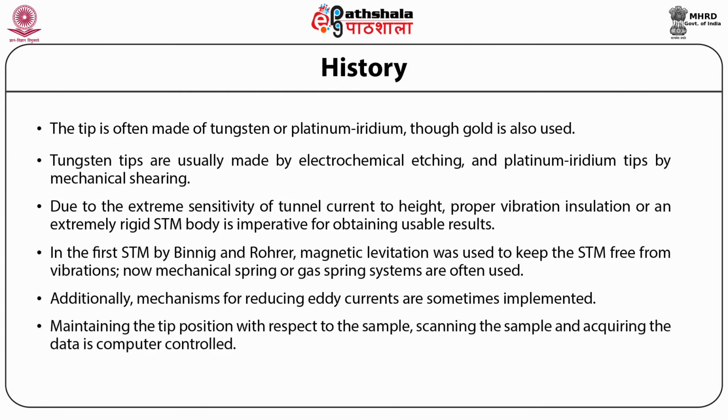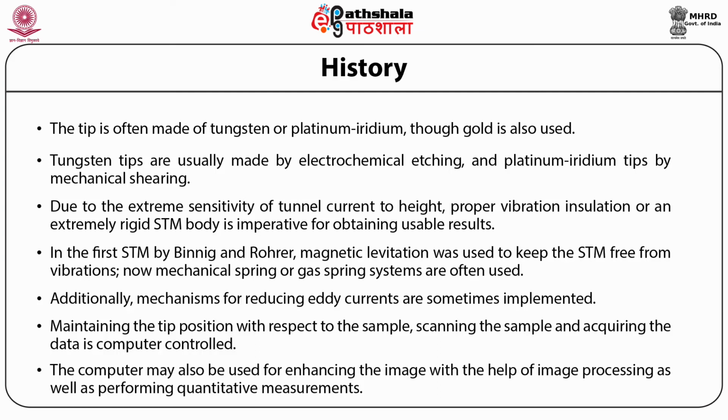Maintaining the tip position with respect to the sample, scanning the sample, and acquiring the data is computer controlled. The computer may also be used for enhancing the image with image processing as well as performing quantitative measurements.